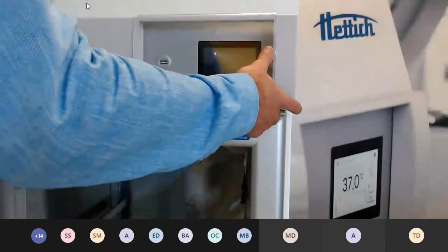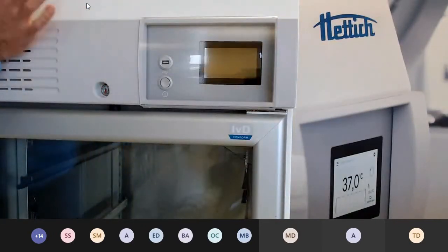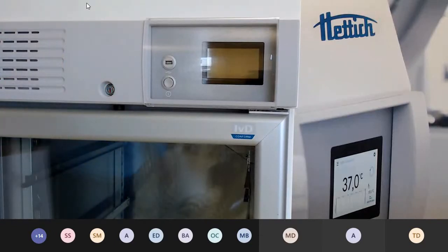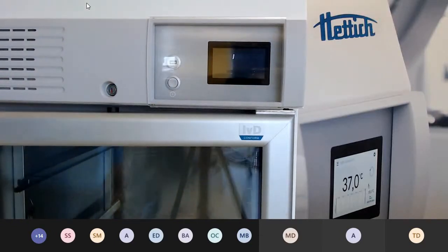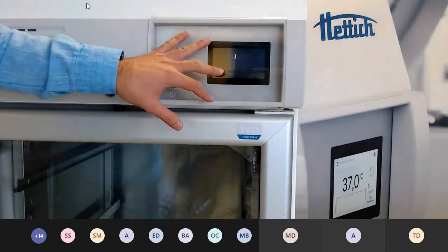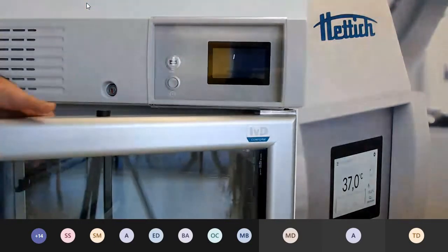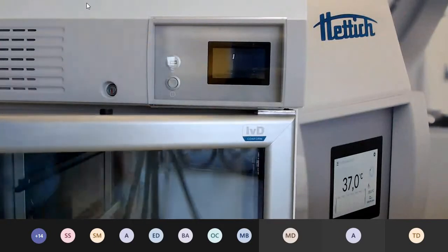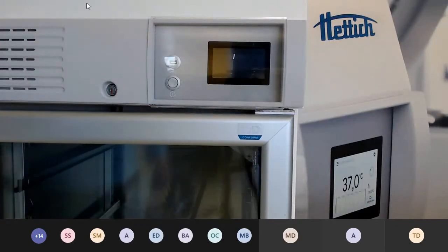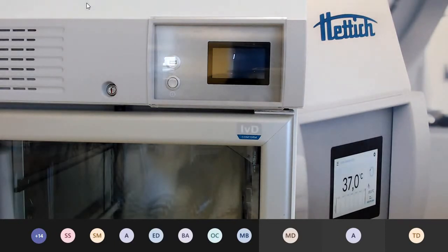Of course, check all plugs, check the temperature, check the function, if it works. You also can check the tolerance alarm, or the door alarm. That means you can set here the time of the door alarm. Open the door, wait for this time, and if you see an alarm, you can check your checking box on your protocol. That's it. That's not so tricky on the head cube.